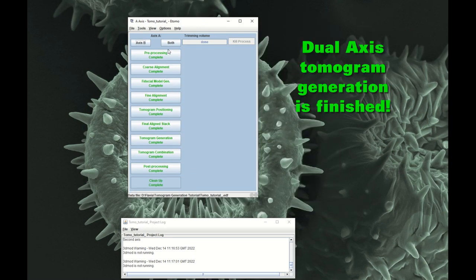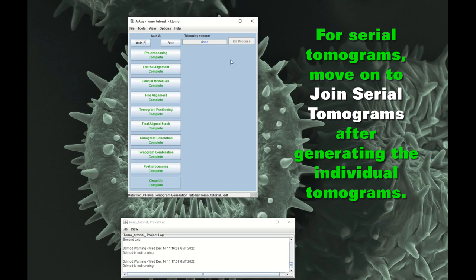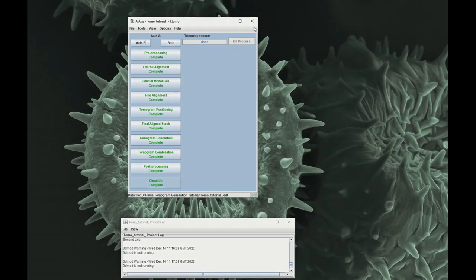All of the steps of tomogram generation have finished. So now you can move on, if you have a series of tomograms, you can then move on to joining serial tomograms.